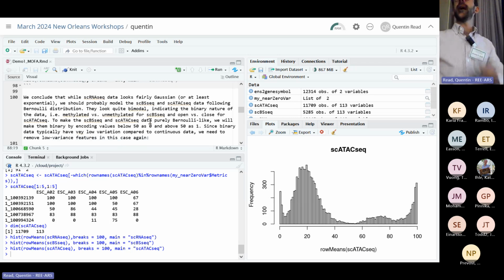Right. So, yes. That's sort of like what I was asking before. To everybody's eyeball, there's clear ways to decide how to divide this kind of a thing. Is there a statistic? And that is exactly what we're going to do, is use the eyeball test here and divide it at 50, because there's not very much at 50. So 50%, we're just not going to do a formal test.